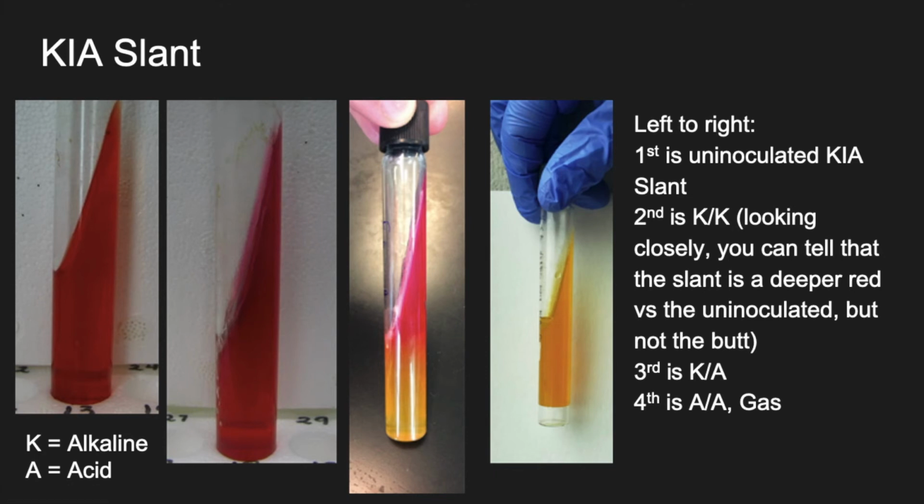So that's what it means by agar lifting off the glass test tube, or the agar breaks or cracks or bubbles form. That is just an indicator that gas was formed. That agar completely rose above the bottom of the test tube.